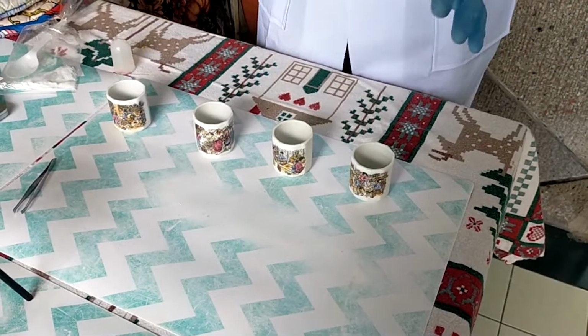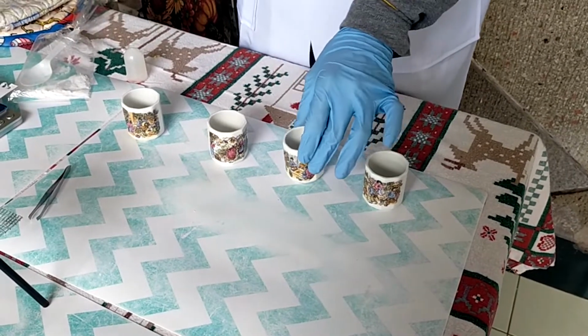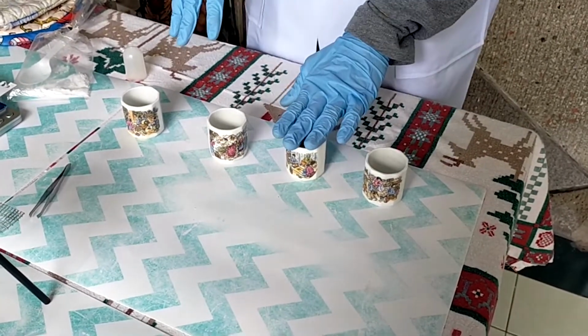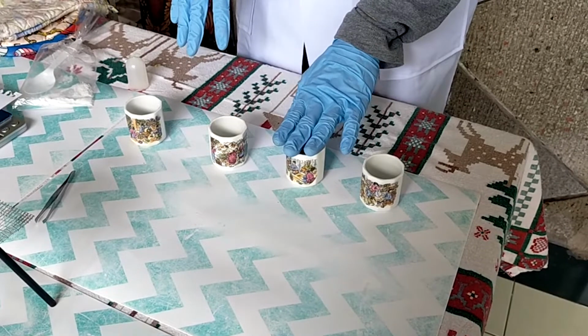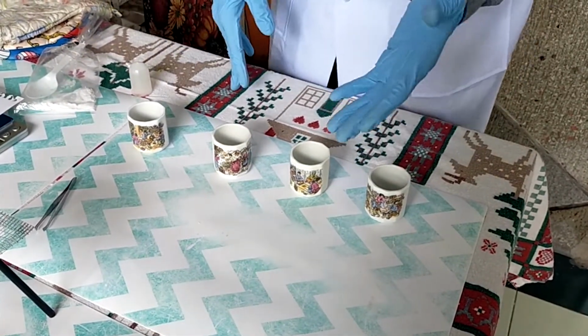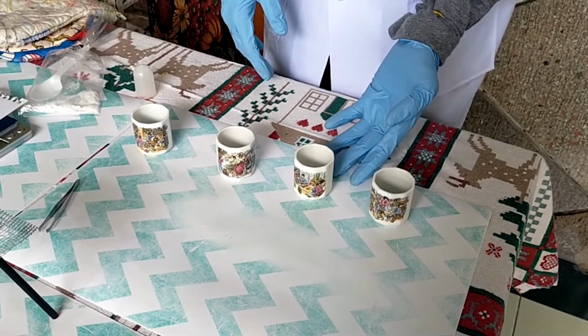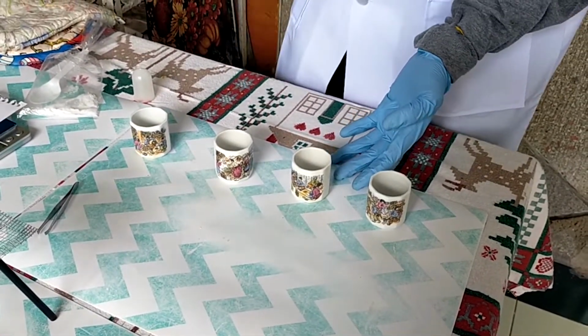From our solubility test, we can conclude that it is ethanol which dissolves naphthalene the best because it has the least amount of naphthalene solids present after some time. Okay, so we will be using ethanol as our best solvent in the recrystallization of naphthalene.